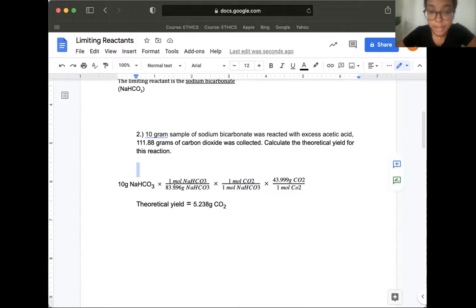10 grams divided by 83.996 grams times 1. These two cancel out, times 43.999 grams of carbon dioxide. This will give me 5.238 grams of carbon dioxide as my theoretical yield. Thank you. That concludes my experiment.